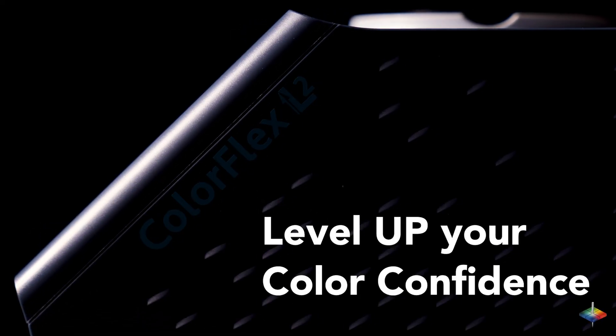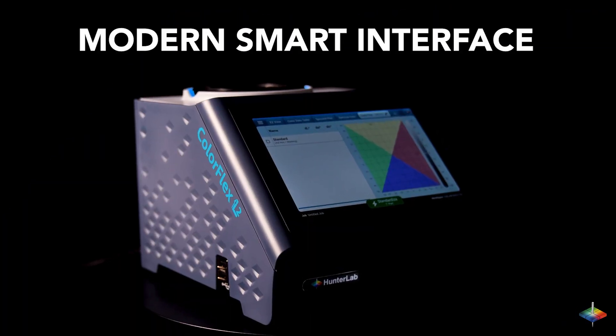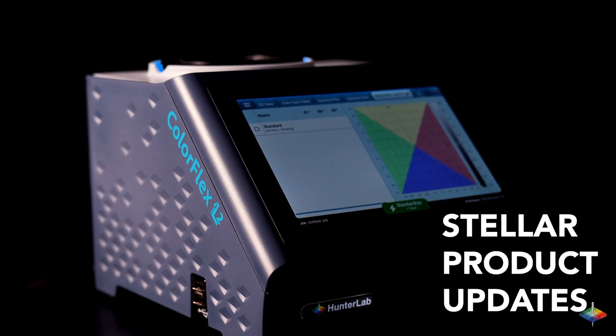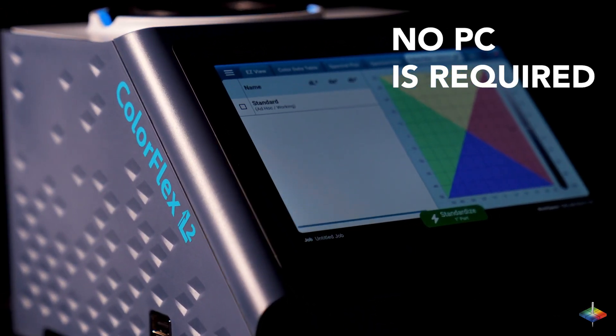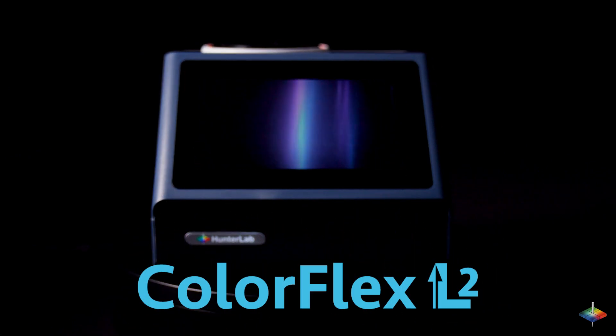Level up your color confidence with the ColorFlex L2. Now enhanced with a modern and smart interface, a sealed spill-proof case, stellar product updates, and so powerful that no PC is required. Introducing the next-gen HunterLab ColorFlex L2 Spectrophotometer.